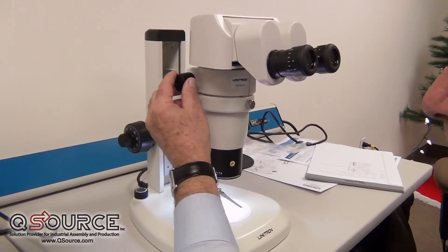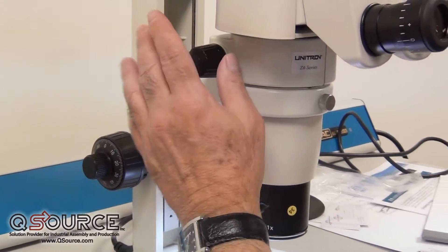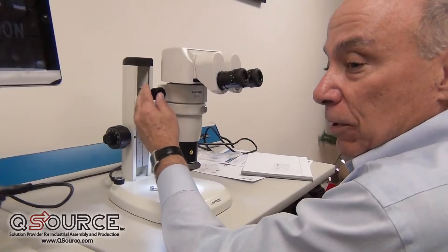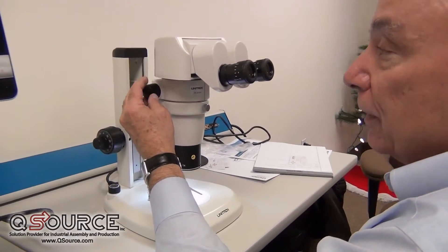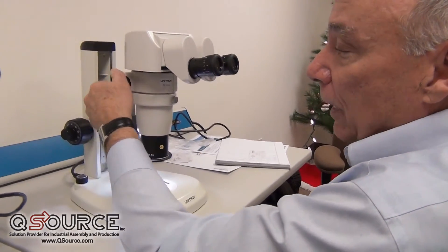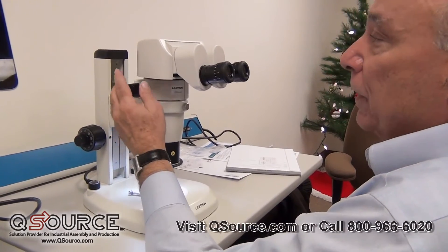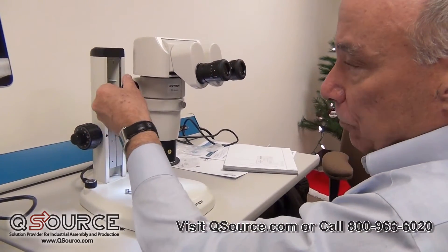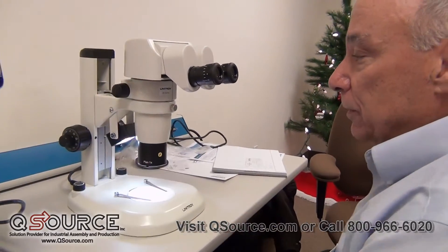Now, because we've set this at the high magnification, when we zoom down, the image will remain in focus. That's called parfocality. If we did it the other way, from low power to high power, it would not remain in focus. So the proper way is always to have the zoom knob at high power, get your image into sharp focus, and then it will remain parfocal through the zoom range. That's the proper way to adjust the stereo microscope.